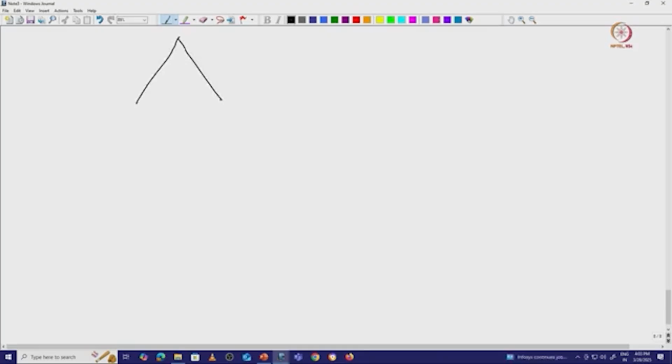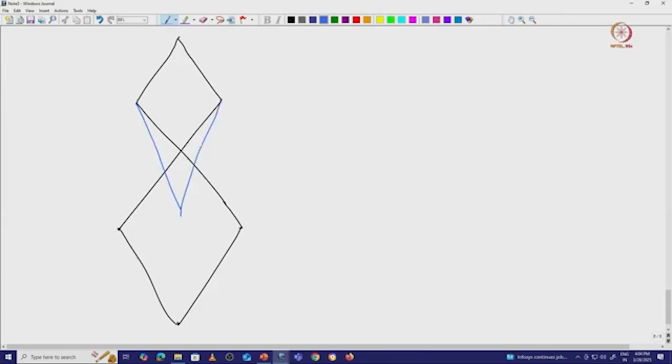We have electrons, and as I mentioned previously, there will be a crossover point; the electrons will go like that and merge at one particular point. It will be better if we draw this diagram in a slightly different way, as it will help us explain. Now, it is going and giving us a point. There is another possibility, that the electron beam will spread.